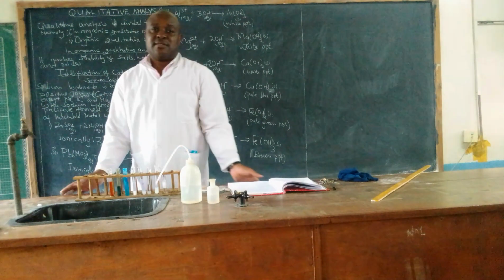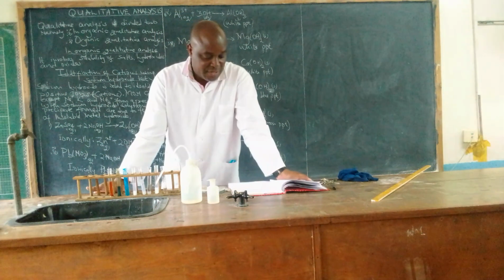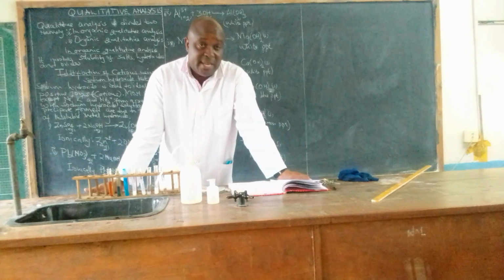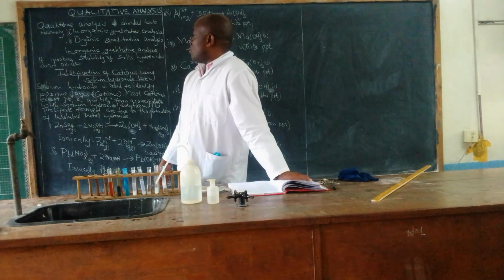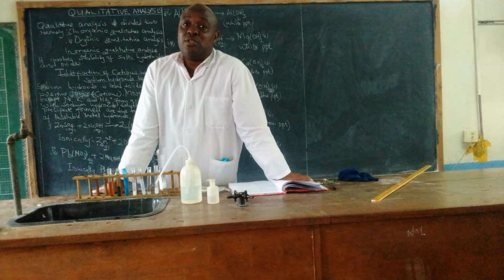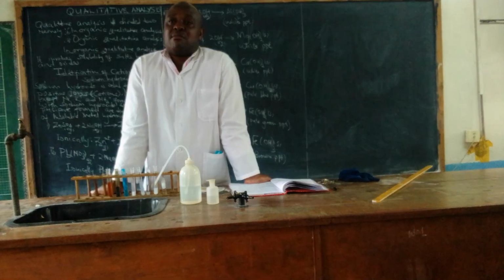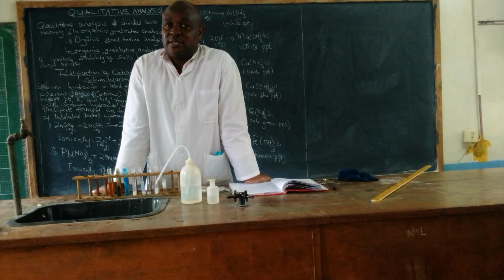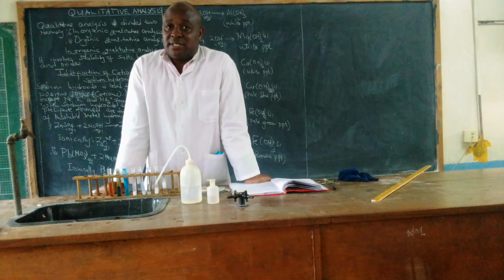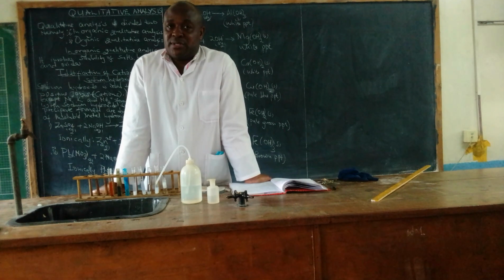For those few remarks, I've just marked the end of today's presentation as far as inorganic qualitative analysis with sodium hydroxide is concerned. When we shall be meeting next time, we shall continue with inorganic qualitative analysis, but we shall now be testing with the ammonia solution.